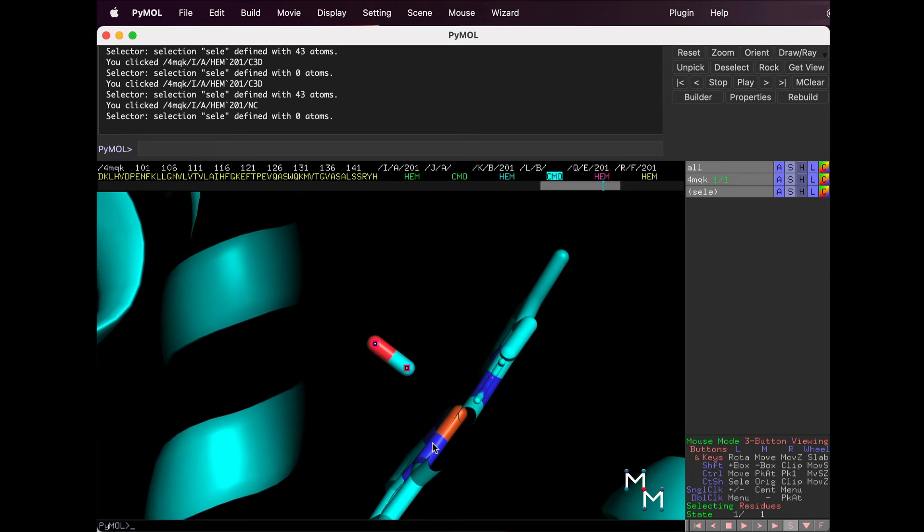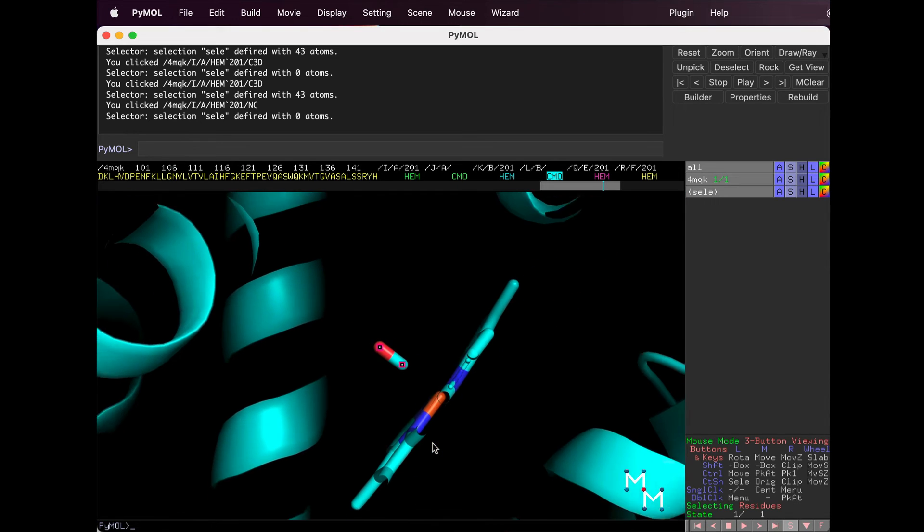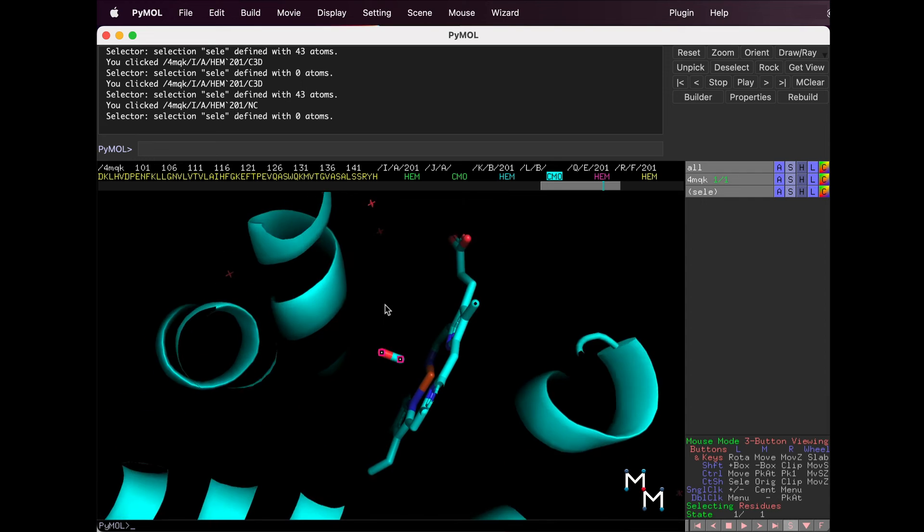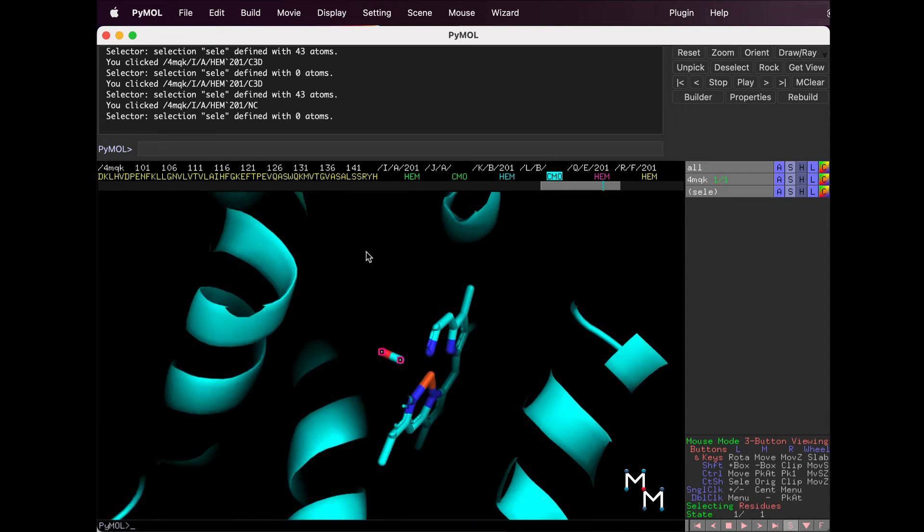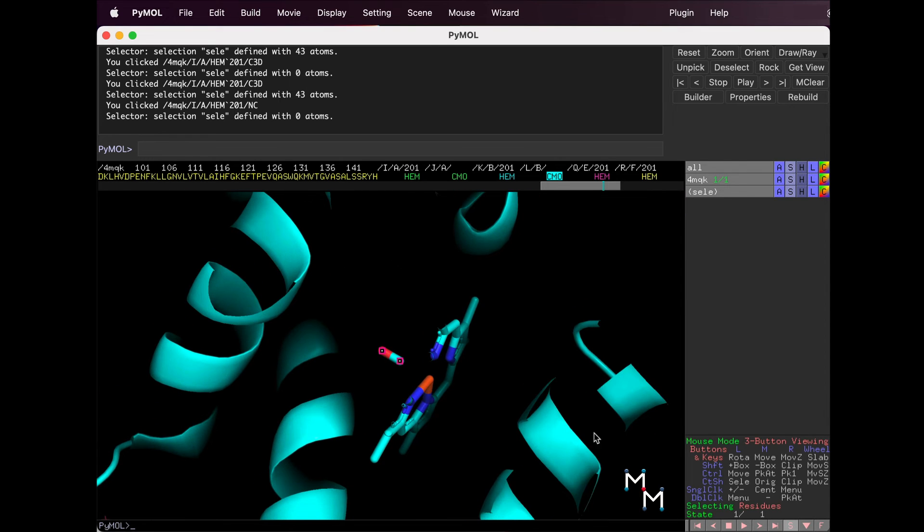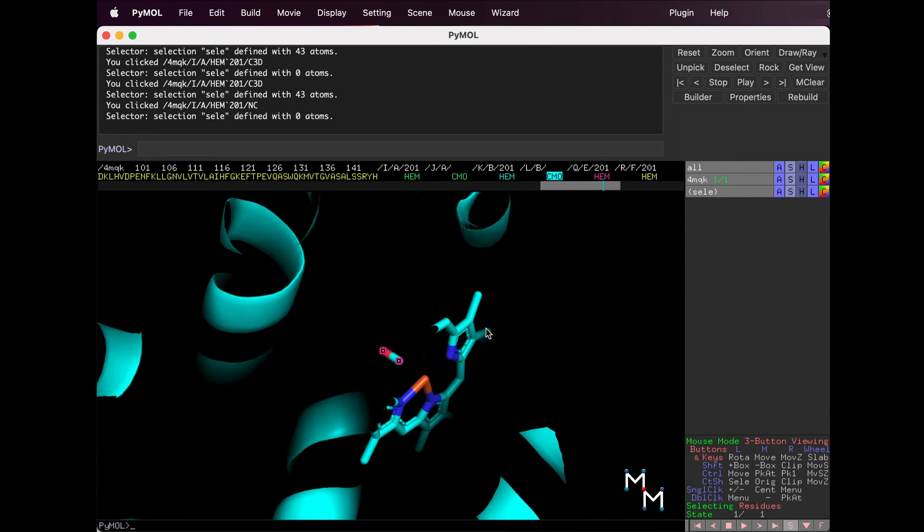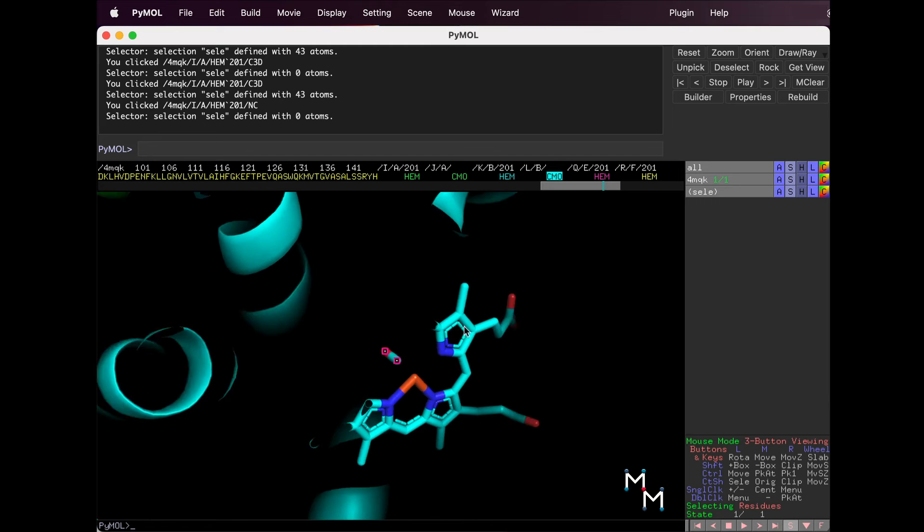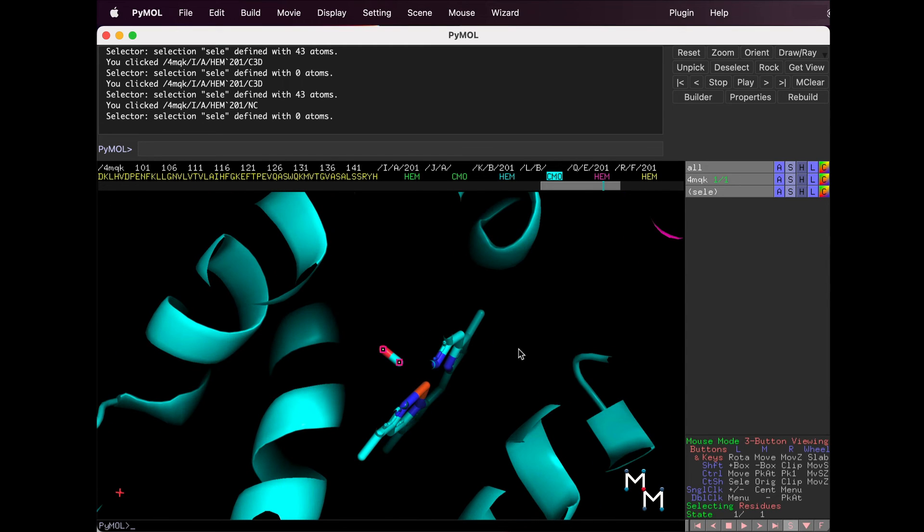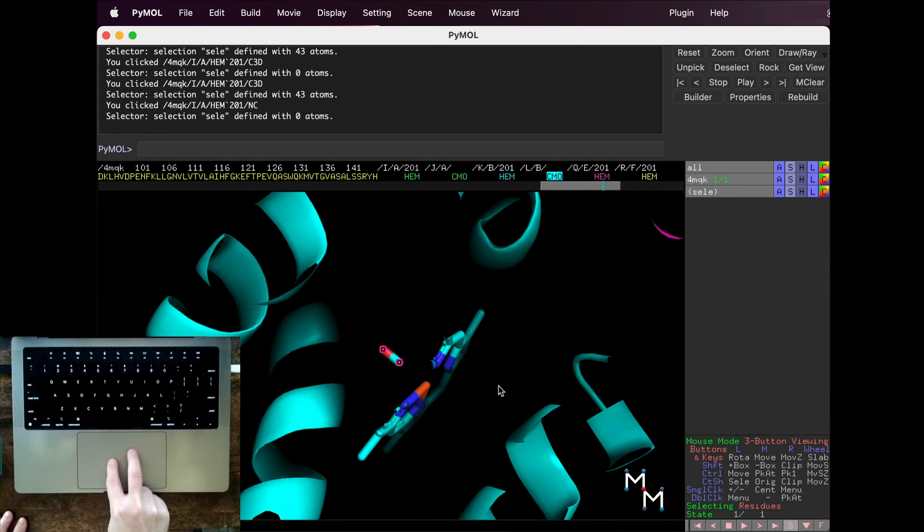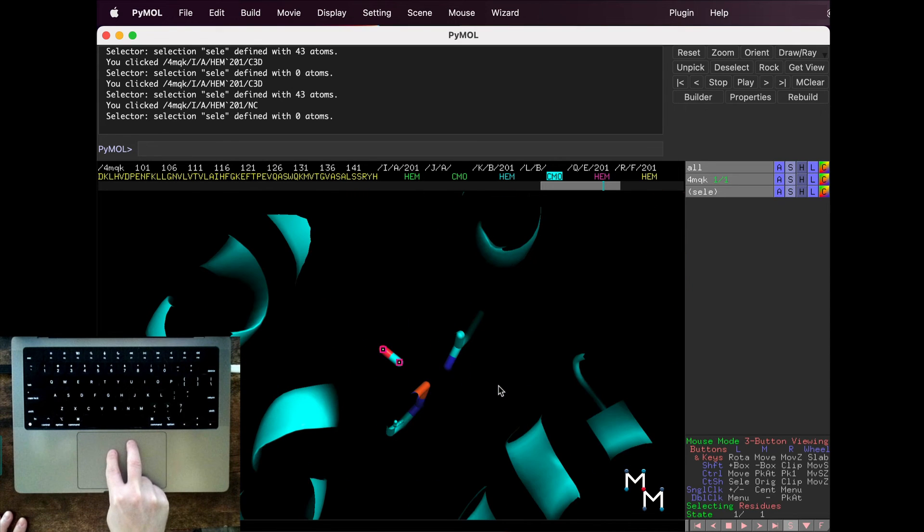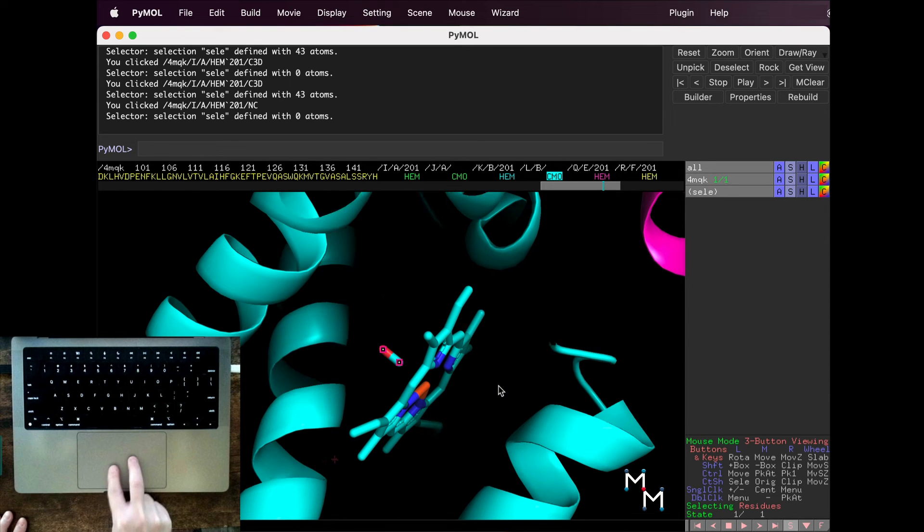Now, notice how parts of hemoglobin appear chopped off. This is because zoom applies clipping to the structure. Clipping shaves away layers of the molecule so that whatever you zoomed in on can be seen easily. Adjust the clipping by running two fingers up or down on the trackpad.